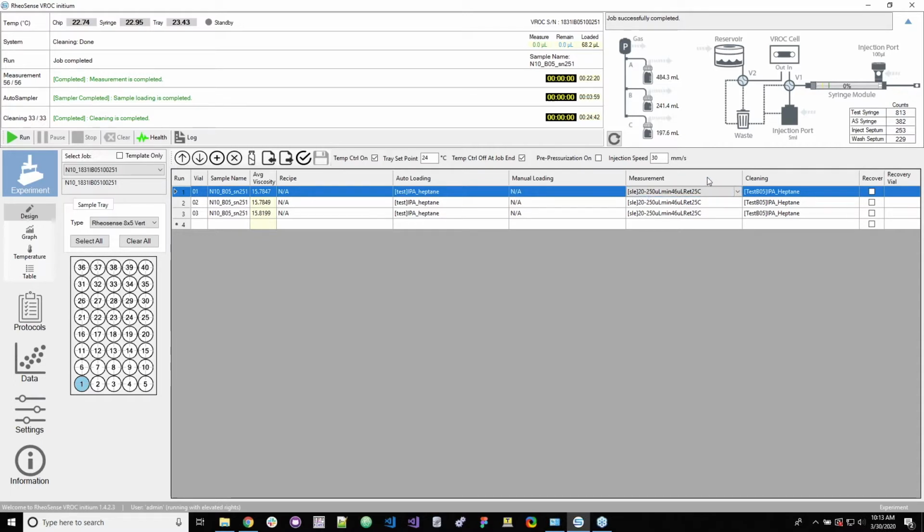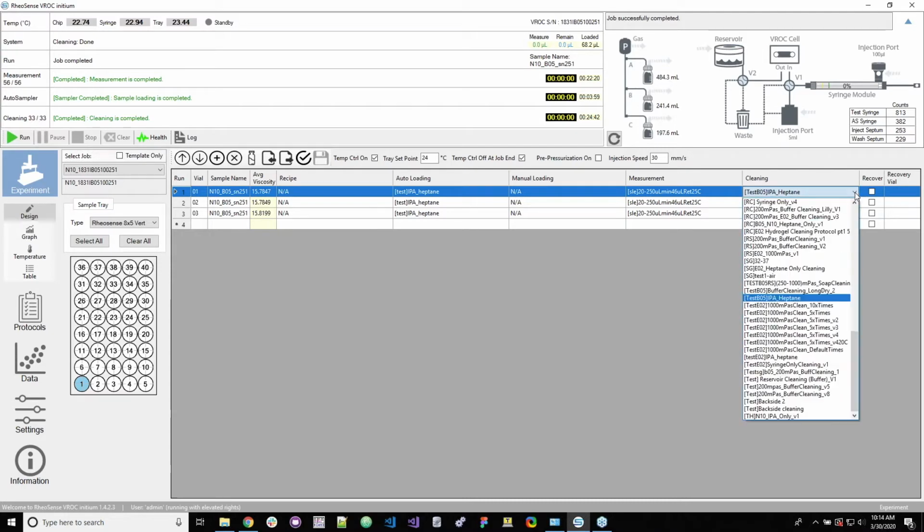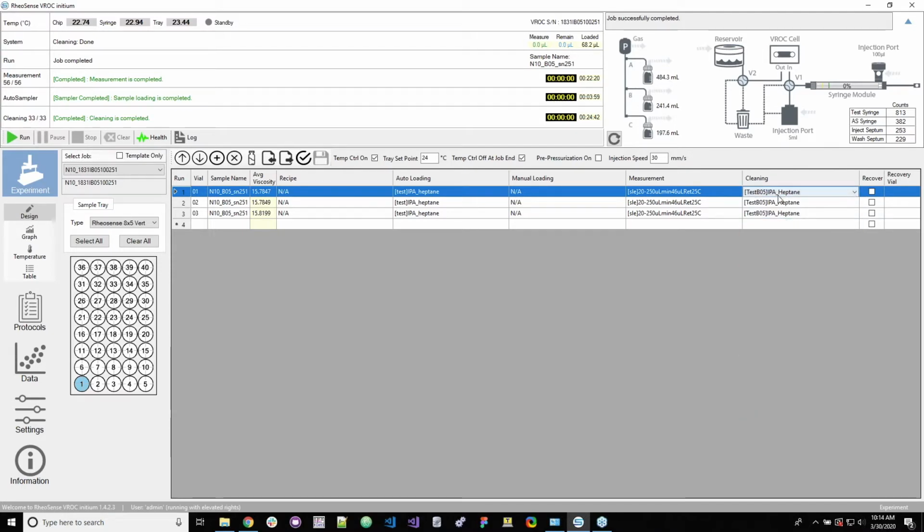So you can create your own measurement protocols and run them, and you can select those pre-made or self-made measurement protocols here. And then we have our cleaning protocols here in this column, which again, the instrument has a preset list of cleaning protocols that we provide for you. Do not create your own cleaning protocols. There's a lot of research and development that we do in-house to ensure that the cleaning protocols are optimized for your instrument. So do not mess with cleaning protocols. We can help you create your own cleaning protocols if you ask, but do not make your own cleaning protocols.